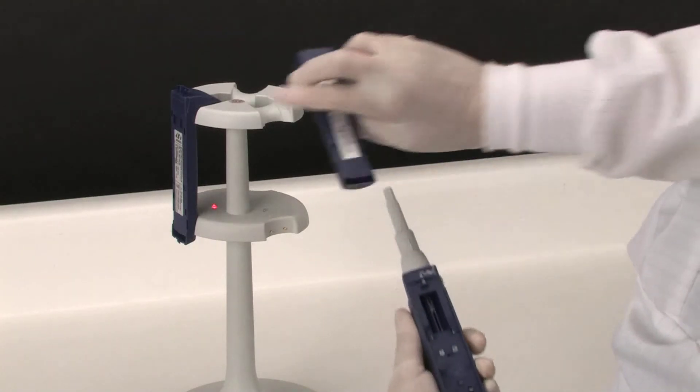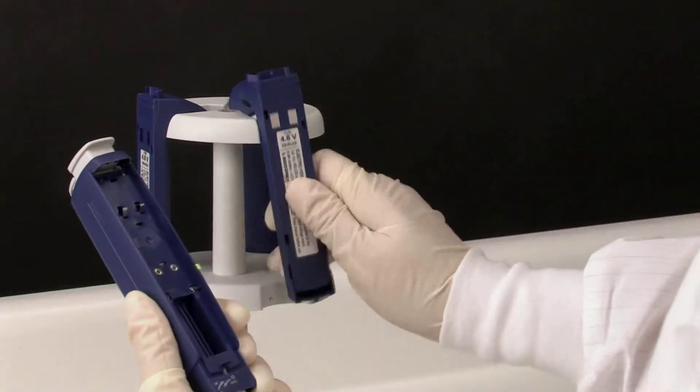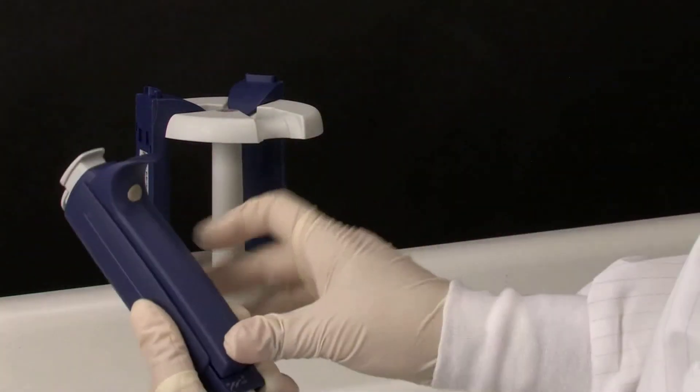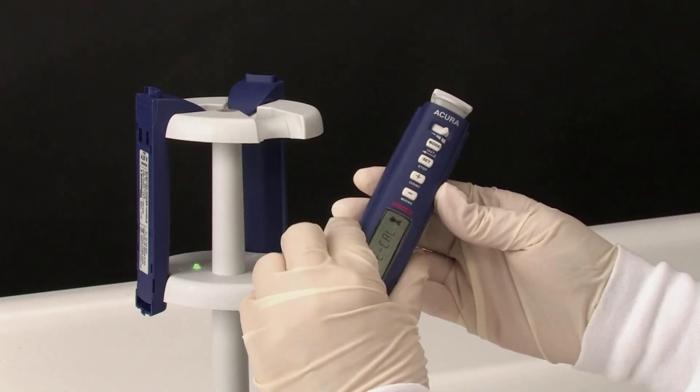The spent battery can be easily removed and placed on the charging stand. When charging is complete, the LED light turns to green. The charged battery can be placed on a pipet to continue work without interruption.